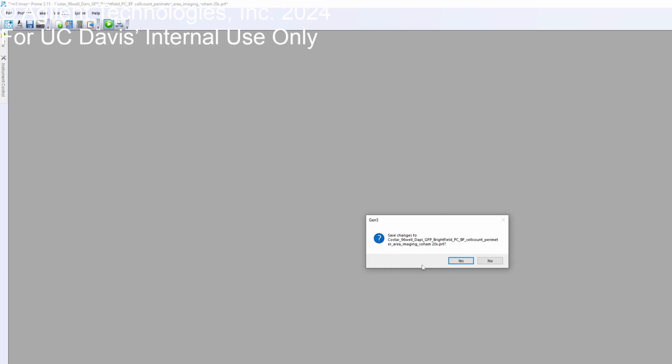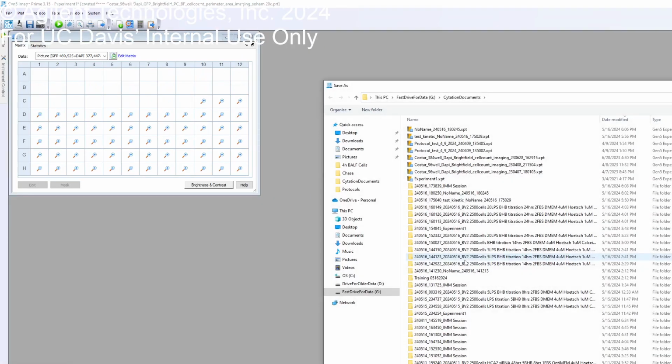And sure, let's just see what changes. He doesn't really need the 20x. He's probably going to use the 10x, but this is just to showcase. Should I add something like test, so I don't mess up this protocol? We already changed the protocol, but this is something I made, so it's not really what he uses.